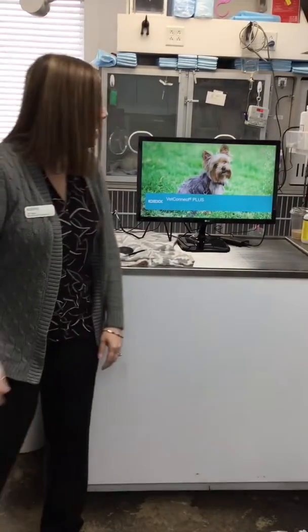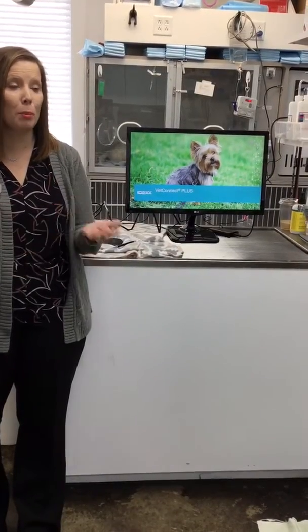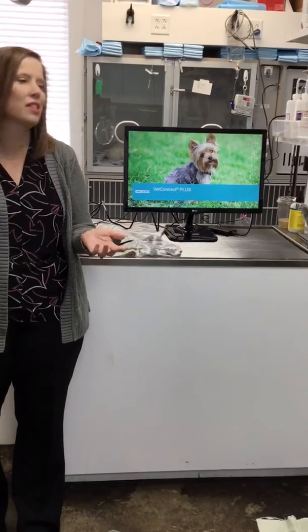So, still here. What we're going to do today is go over VetConnect Plus a little bit. I'm going to show you what it is. You can actually look up tests on it, so you don't have to look at the book or try to find a test in the book. It's no fun, so this is super quick. All of your results will go in. We'll talk about sharing them, and also what you can do if you need to put a new code in eVet. Then, depending on how much time we have left and how much fun y'all are having, we're going to do a quiz on stuff you should know about the analyzers.